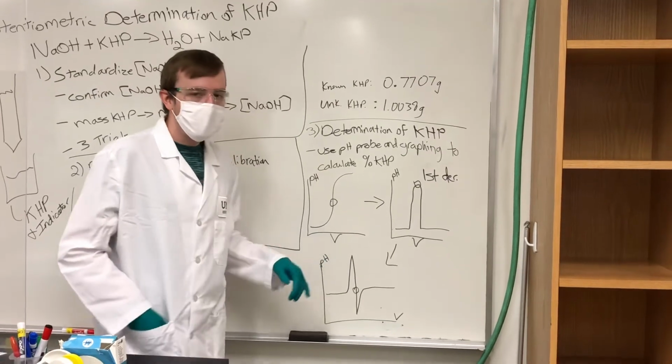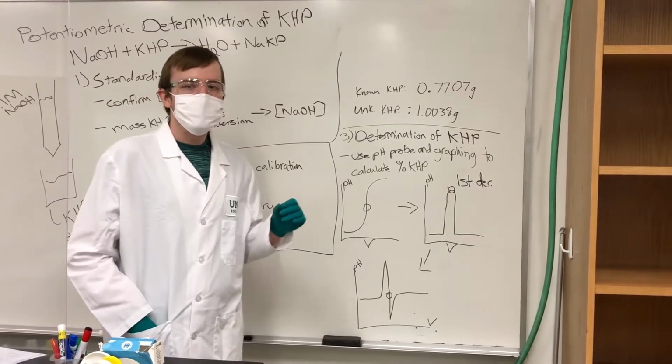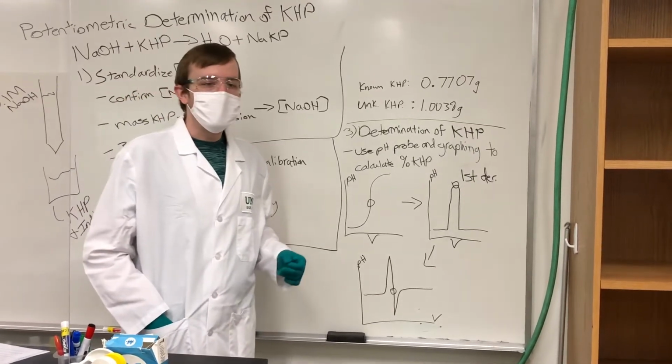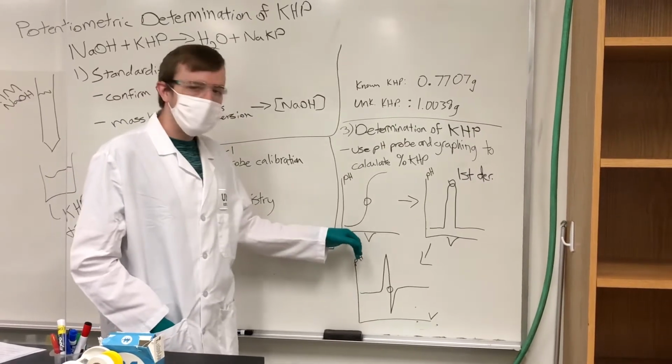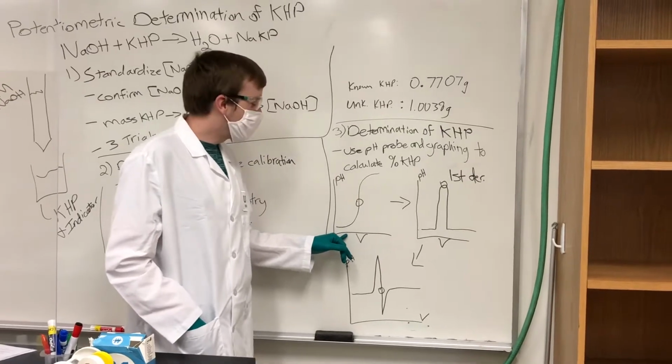Whenever you're doing the titration, you want to keep track of the pH that's being monitored by the probe and also the amount of solution that you've added, because you'll need to plot a graph like such. These graphs you've already seen before on pH versus volume change.